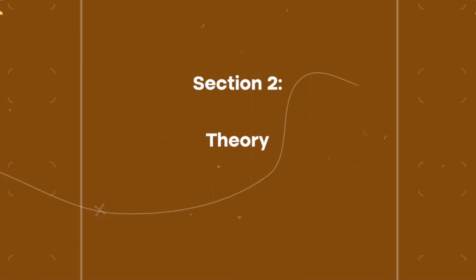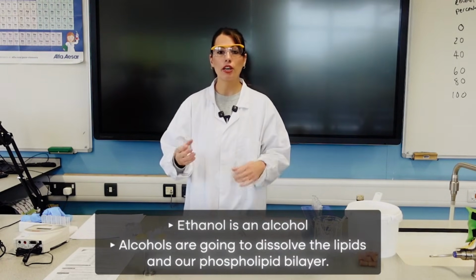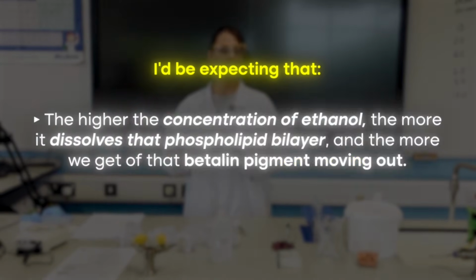So the theory behind this one is ethanol is an alcohol, and alcohols are going to dissolve the lipids, and our phospholipid bilayer, because it's phospholipid, will be dissolved by the ethanol. So I'd be expecting that the higher the concentration of ethanol, the more it dissolves that phospholipid bilayer, and the more we get of that pigment moving out.